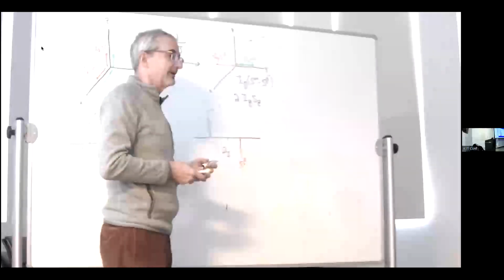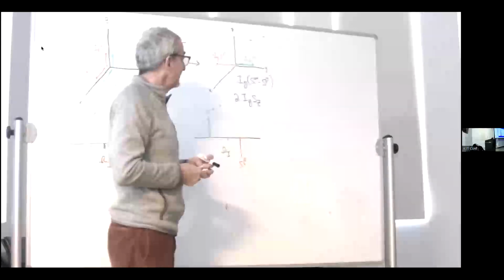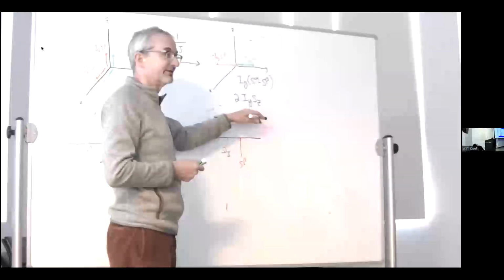And now, suppose I apply a 90-degree X pulse at this point on the I spins.